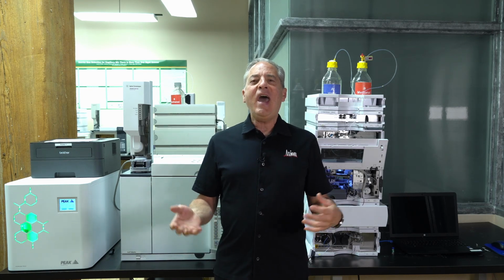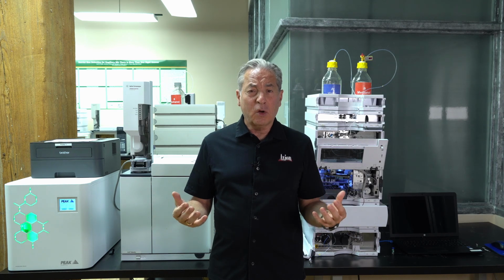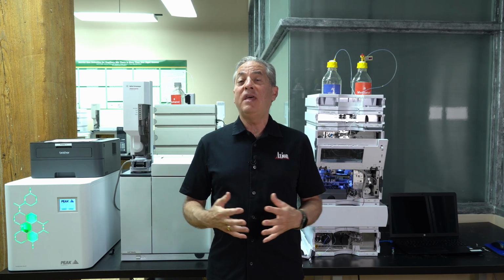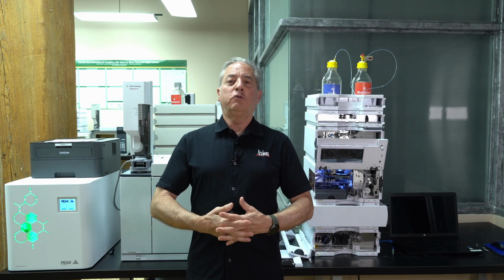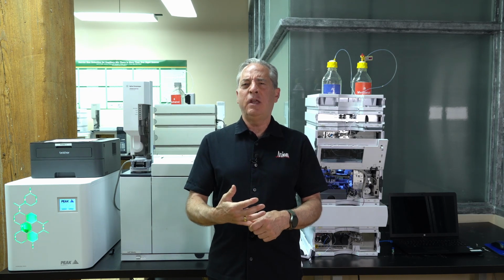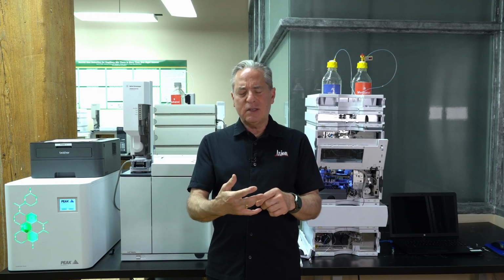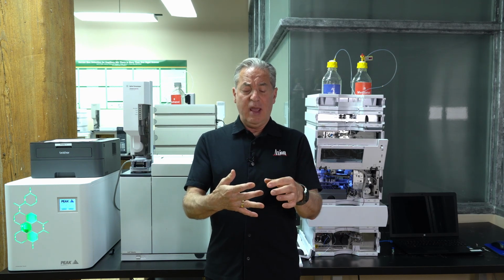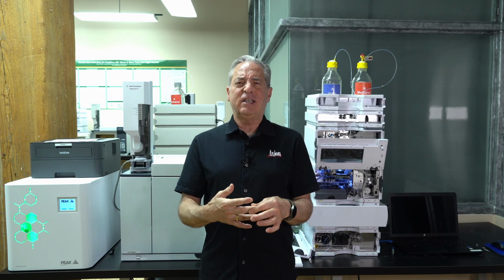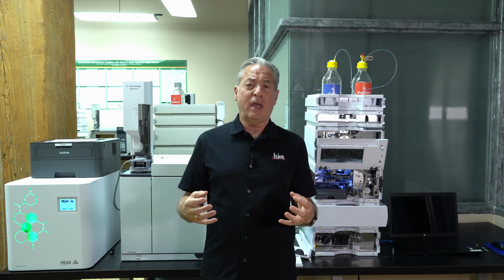What does that mean? Add 10% more water. I assume you're doing reverse phase like the rest of the world. You add 10% more water, and then that will dramatically improve capacity factor. That's going to be the biggest improvement in your resolution. Selectivity, more complicated. It says, do you have the right chemistries involved? And then efficiency, just like in GC, do you have the right column dimensions? Do you have the correct particle size and the column length?